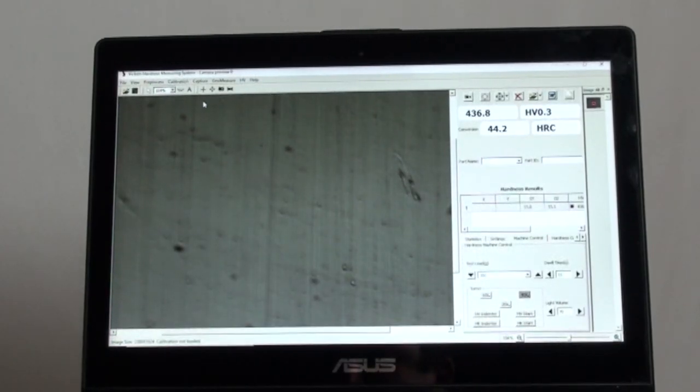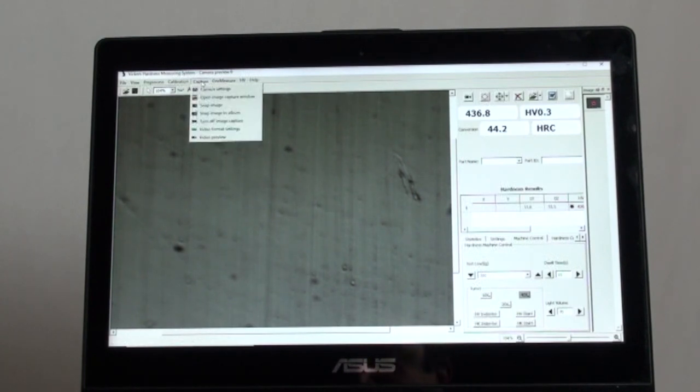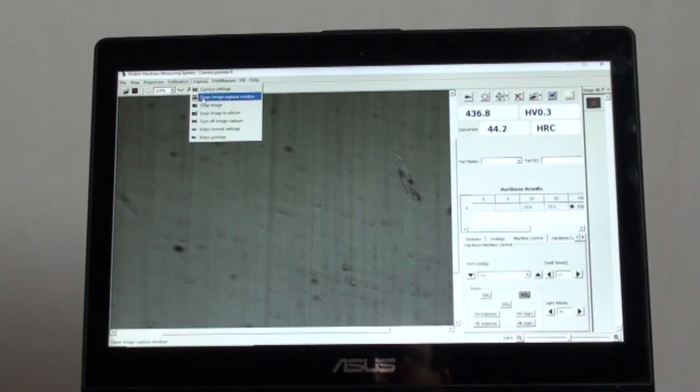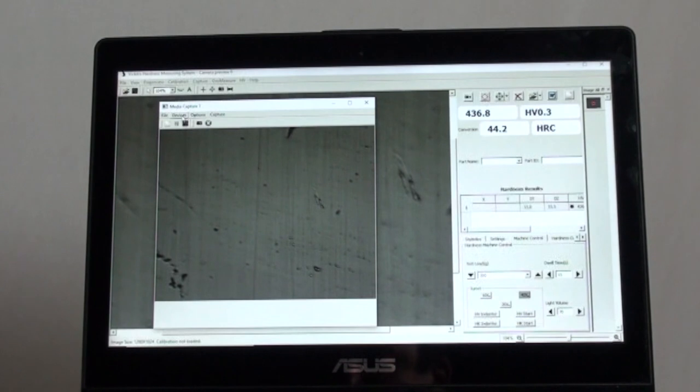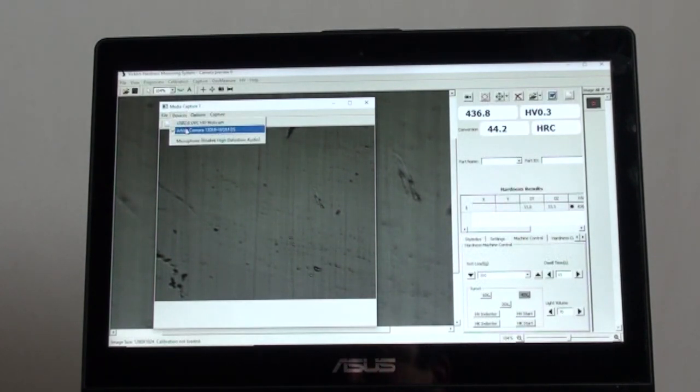Now let's make sure the digital camera system is working and connected. On the top left, click on capture, then click on image capture window, then click on devices, select the R tray camera.